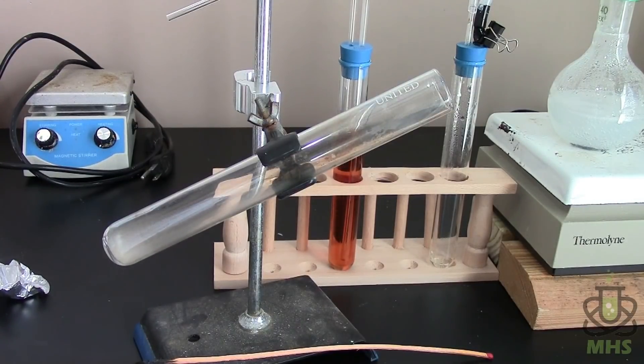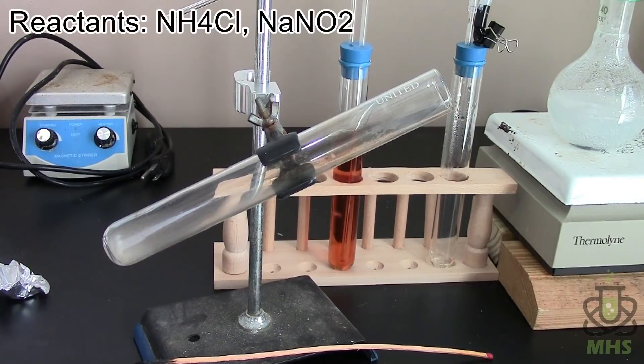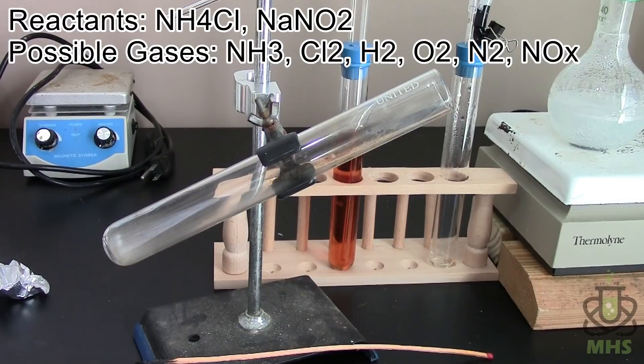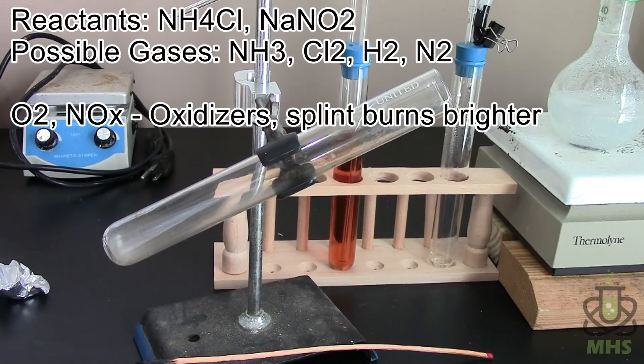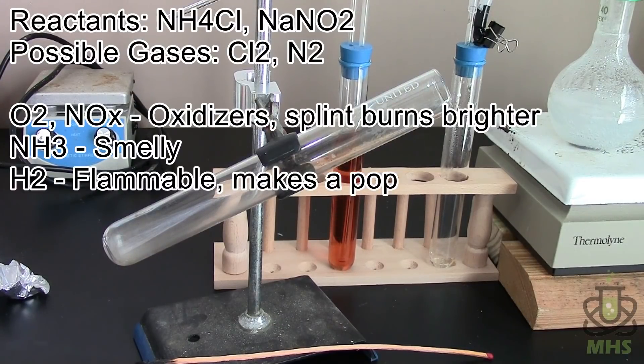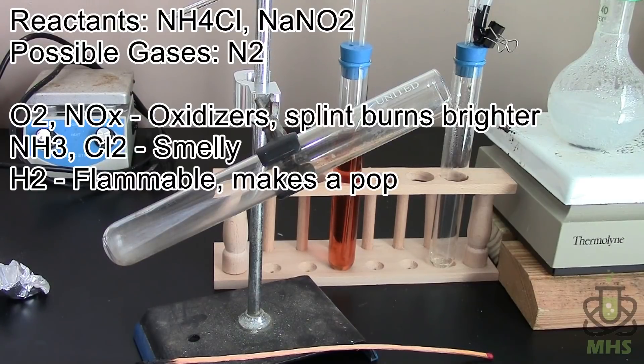But if you look at the reactants that we started with, we've got ammonium chloride and sodium nitrite. So the potential gases I could see being produced are nitrogen of course, nitrogen oxides, maybe ammonia, chlorine somehow, oxygen, maybe hydrogen. But all those gases would behave differently in this test. The oxygen and the nitrous oxides are oxidizers and so they would make the flame brighter. The ammonia I would definitely smell which I don't so it's not that. Hydrogen would make the little pop. Chlorine I would also smell. So if you kind of rule out all the other possibilities really you're just left with nitrogen.